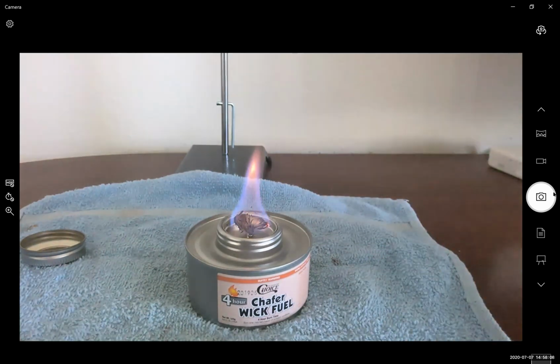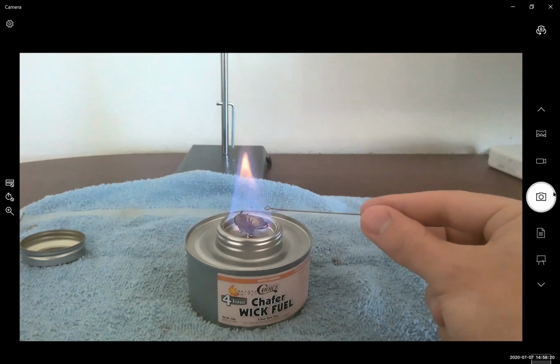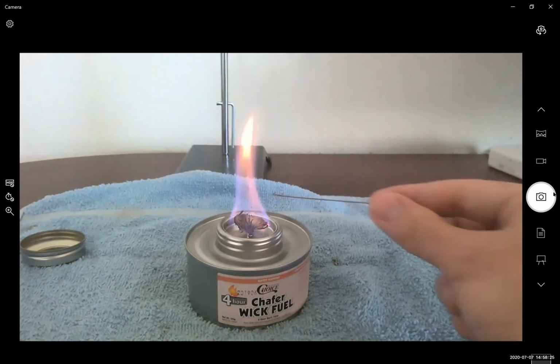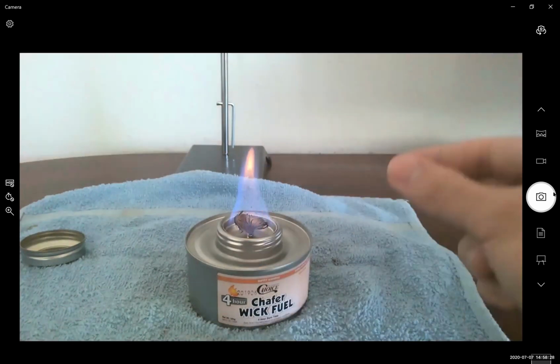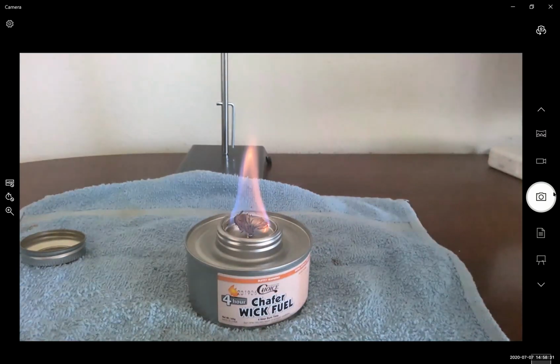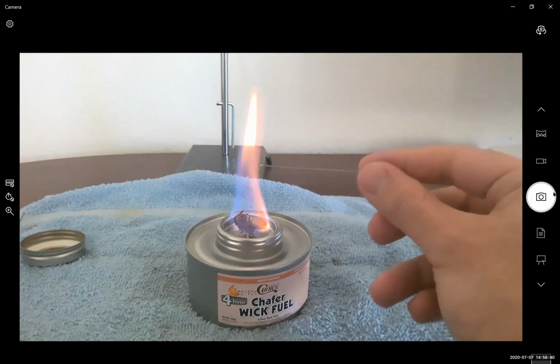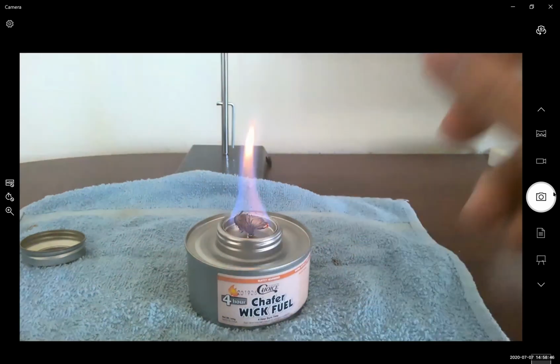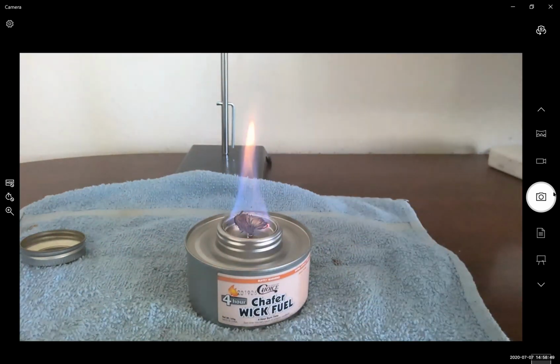Make sure you aren't just noticing the flame interacting with your metal. So you'll want to try to sneak it in on the side. It's tricky. You want to aim for the edge of the cone of the flame. Let's try.